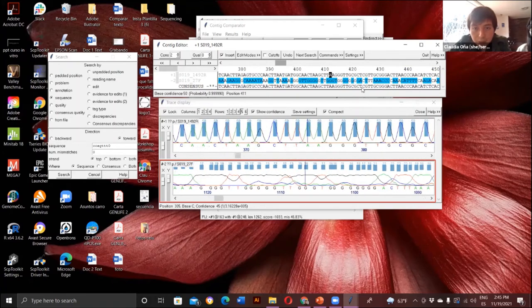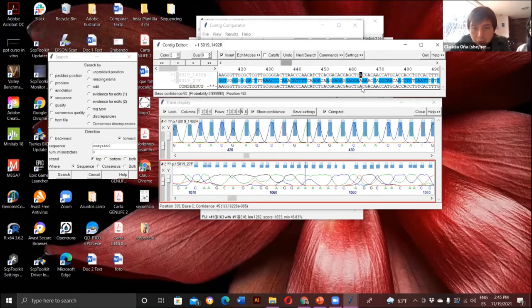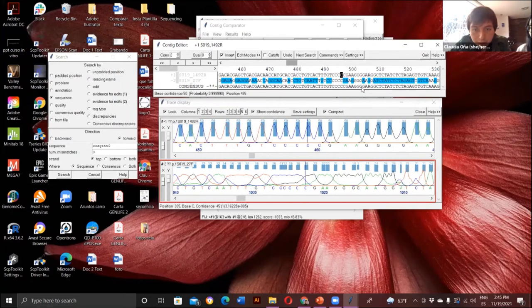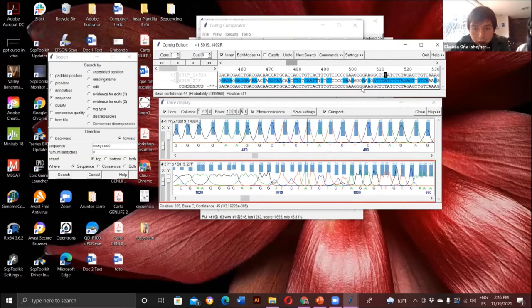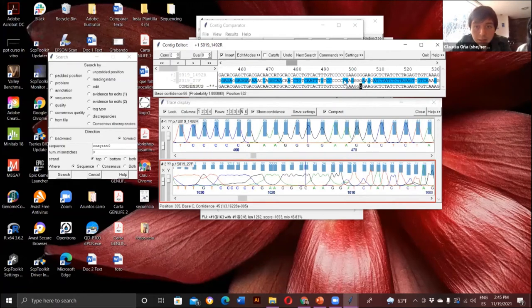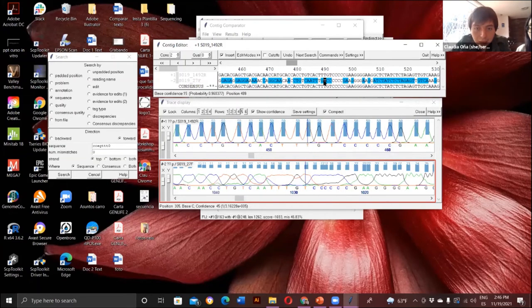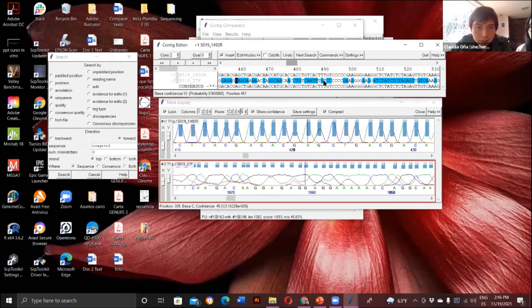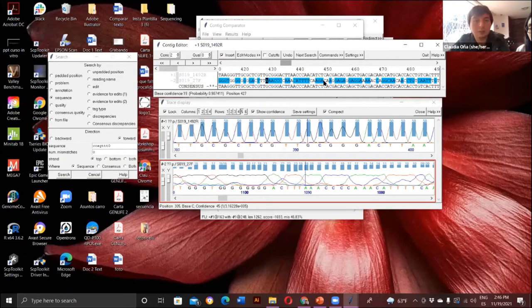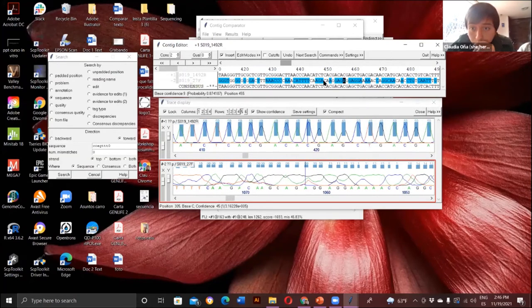At least you have to be this careful until you encounter that you have enough information to make the double checking. So here I might have jumped some errors, but I want to show you how this should be done. So here, for example, I can see that the forward sequence is a little bit displaced to the left. I have to align it again. As the quality of the forward sequence is very bad, I don't mind to modify it. So for example, here, I can see that, let me see, how can I?